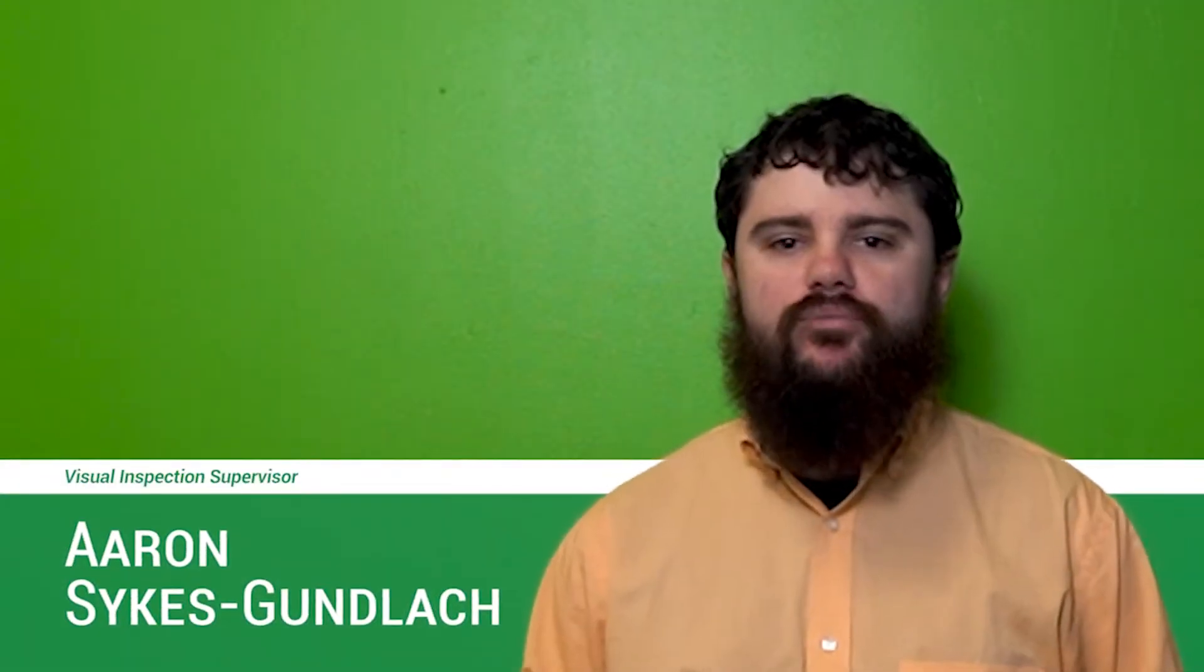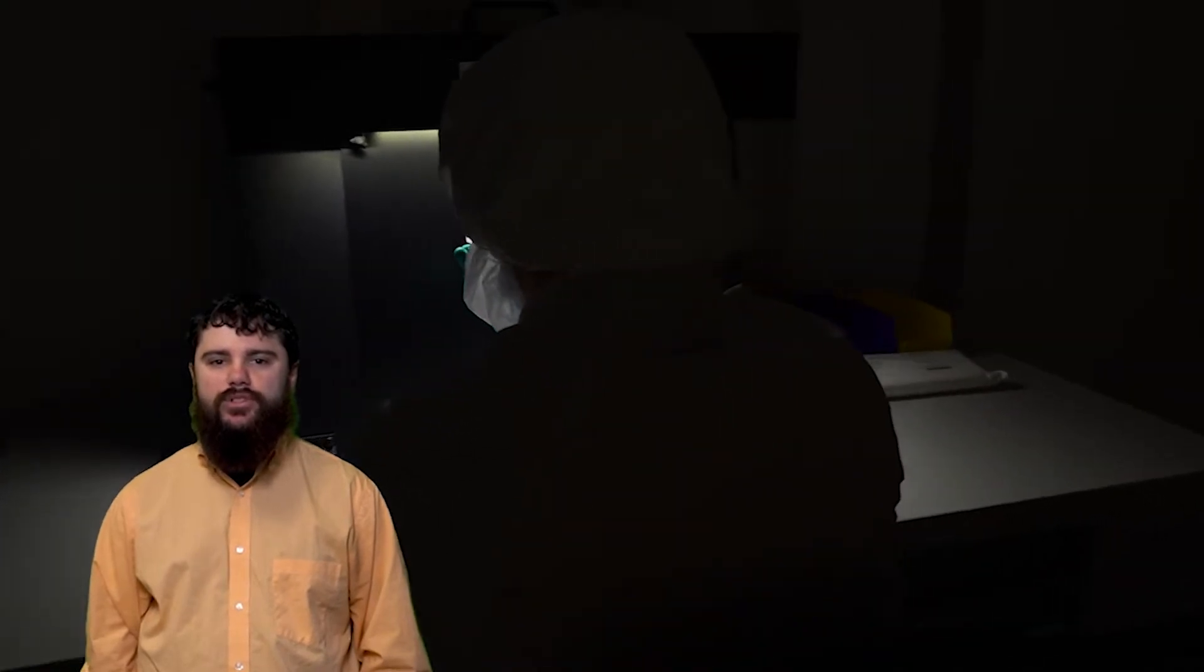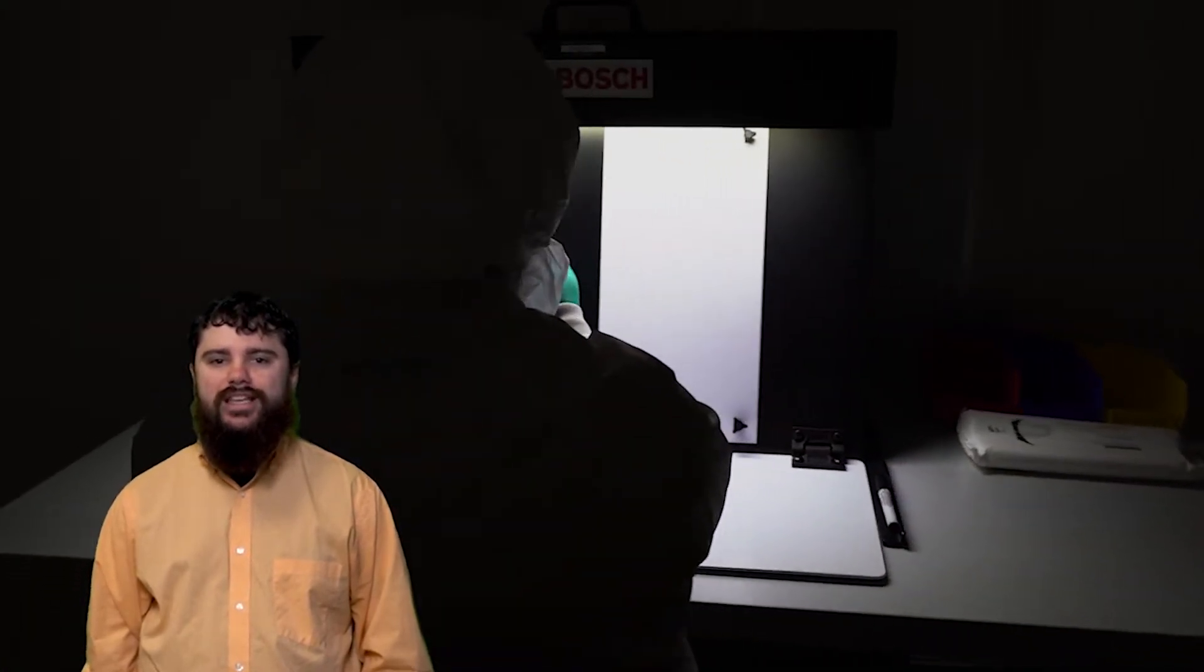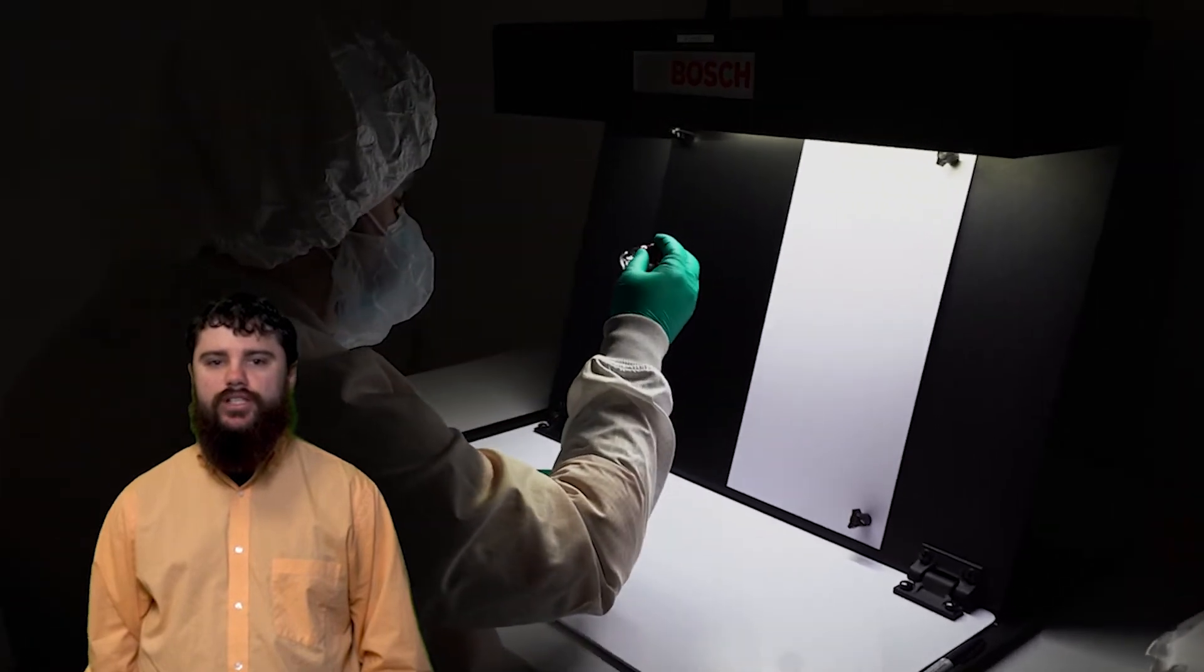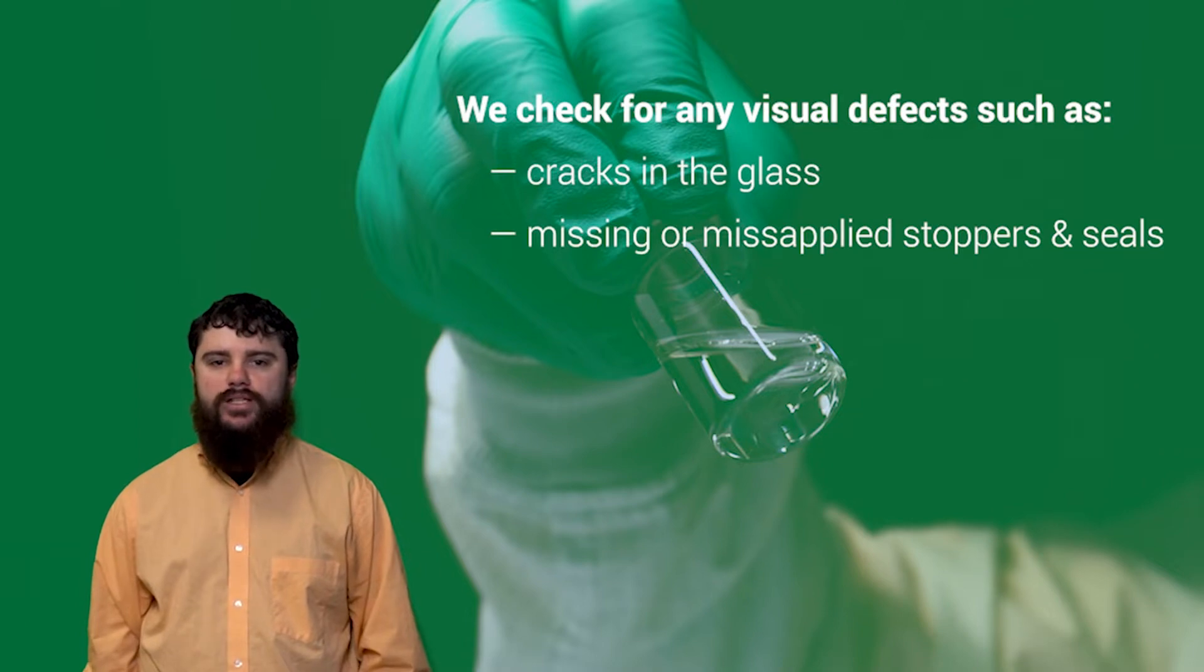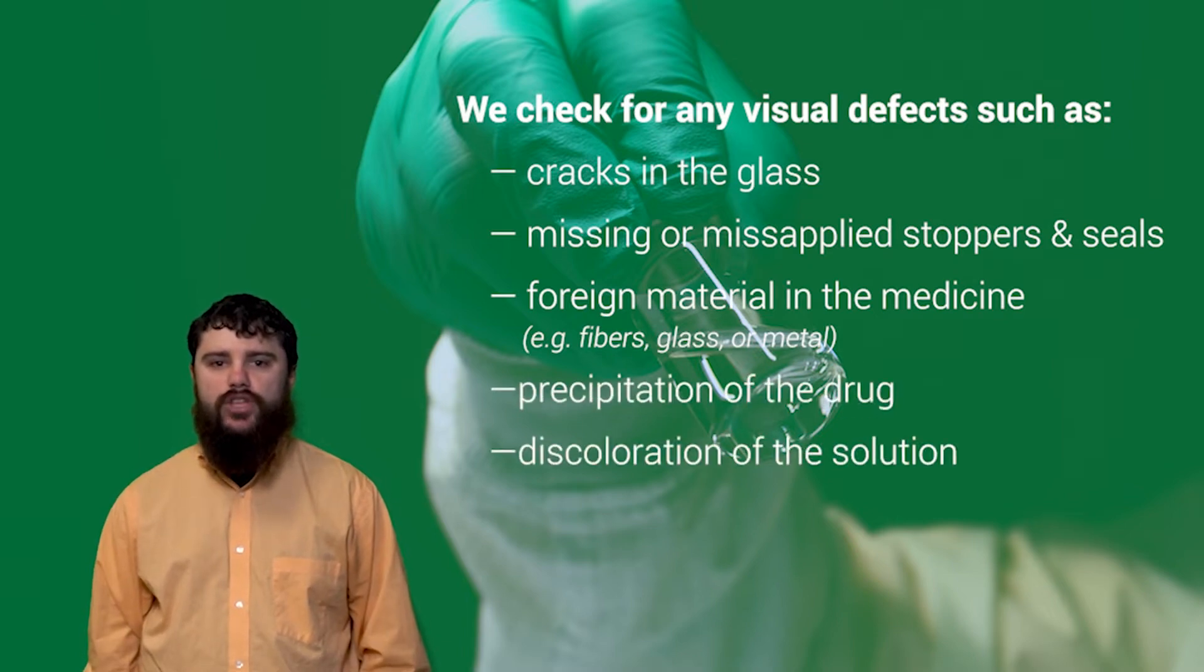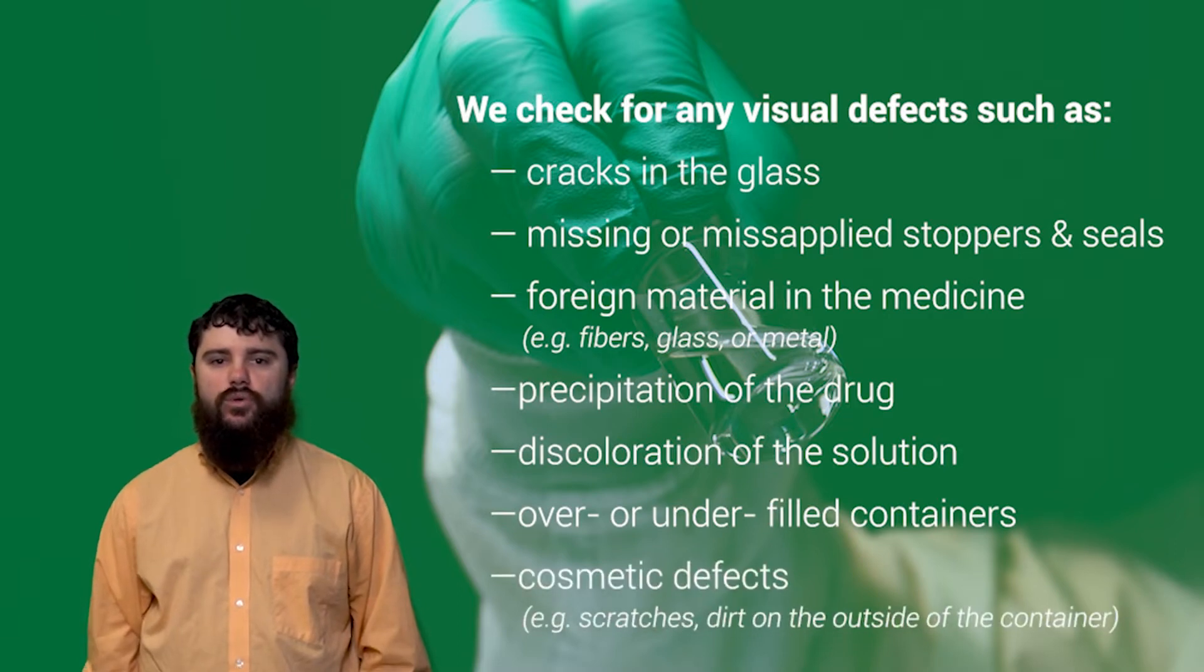Hi, I am Aaron Gunland. I am the supervisor of the Visual Inspection Group at BSM, and have been a member of the BSM team for three years. Welcome to Visual Inspection. While we perform testing in the lab to ensure that the medicine we make is sterile and has the correct specifications, we also need to check for any critical defects, like cracks in the glass of vials, missing or misapplied stoppers and seals, foreign material in the medicine such as fiber, glass, or metal, precipitation or discoloration of the solution, over or under-filled containers, and cosmetic defects such as scratches or dirt on the outside of the container. That is our job!